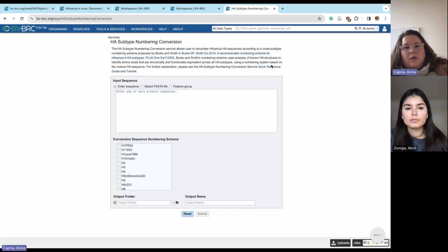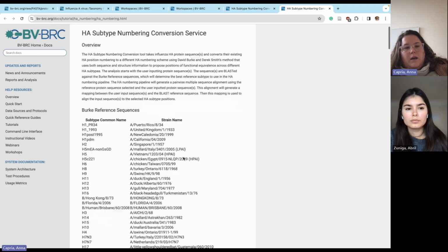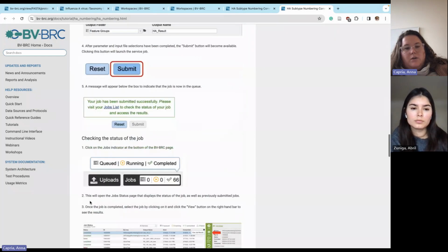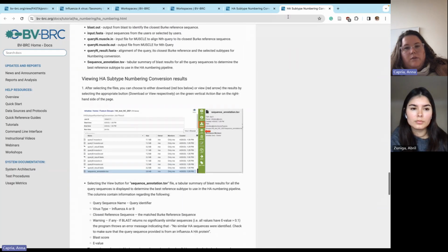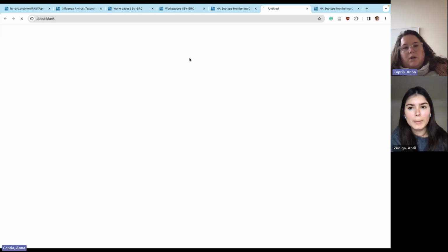It's kind of a quick explanation. We also have a tutorial that has the common names and strains, then a step-by-step guide on how to use the tool, and information about the output files, those action buttons that I just went over. So definitely feel free to use those reference guides and tutorials on any of the services. If you're interested in the paper that's associated with this tool, find it right here.